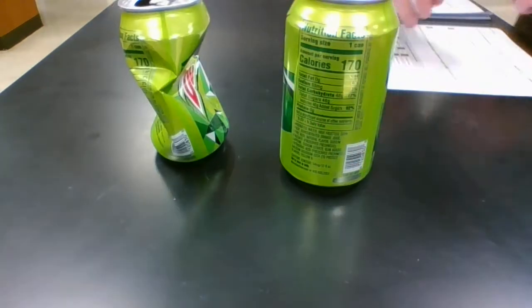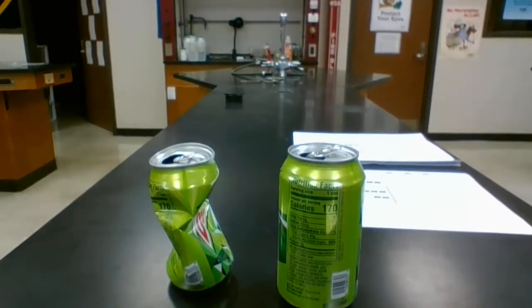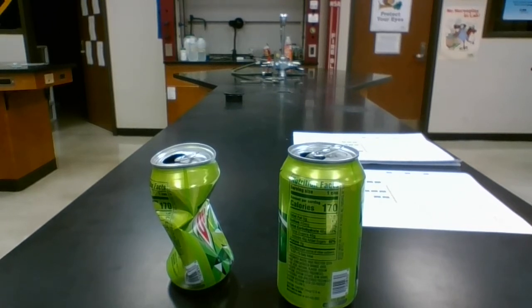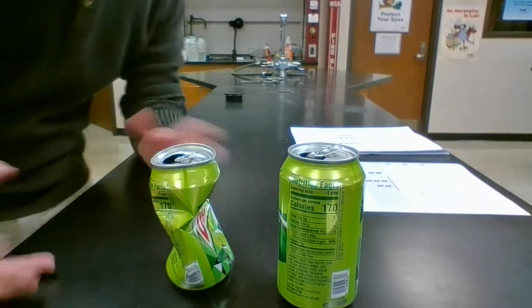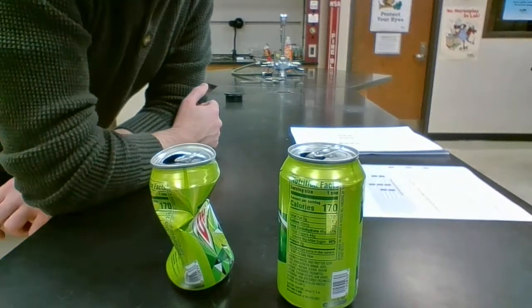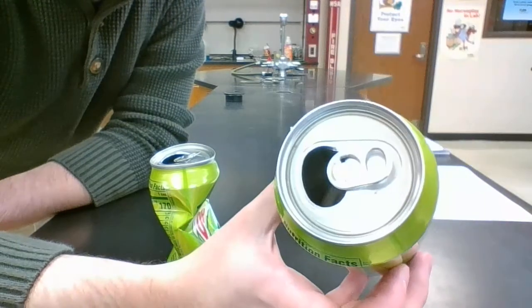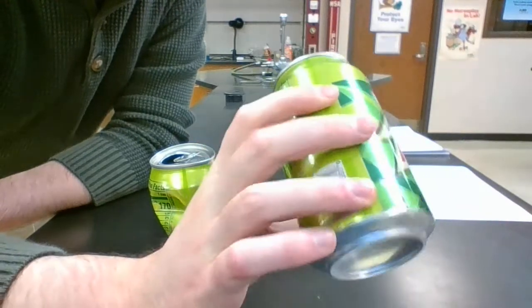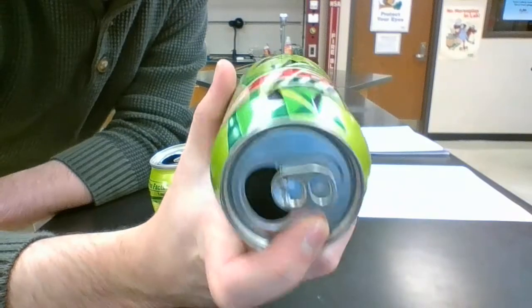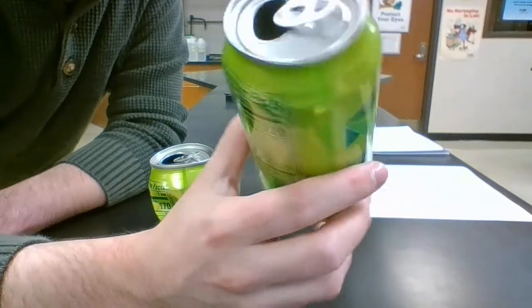Next, we're looking at these crushed and uncrushed cans. Not a whole lot super exciting. I mean, I just took one of these cans and I crushed it with my hand. Now, at first glance, this looks like a pure substance, what this is made of, aside from the colors on the outside. I mean, it just looks like metal. It's just a metal. And you probably call this an aluminum can or a tin can or something like that.